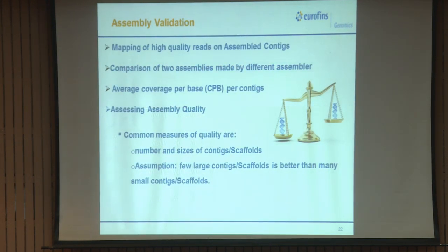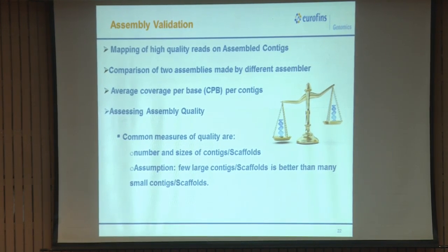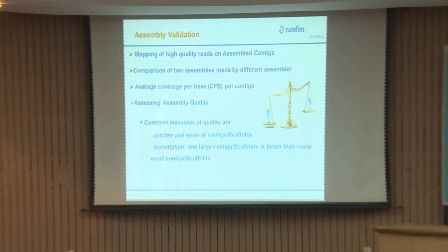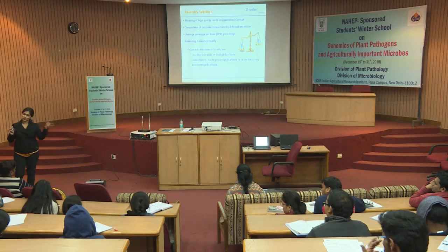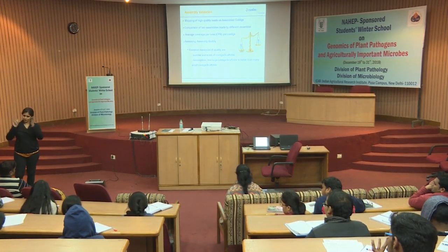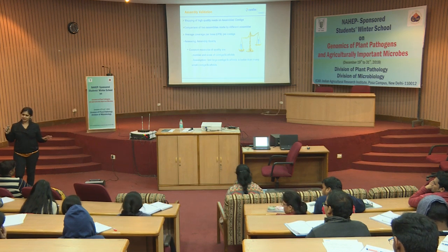Between the scaffolds, that gap is there, right? That gap you are filling with another platform like PacBio, whatever you will use. Yes. Since before you told that 10% may be the error in that platform. But if we are using a hybrid approach, we will eliminate those errors using short read technology. Beforehand only we are eliminating. We will do the filtration beforehand of only PacBio data, eliminate those errors and then use.